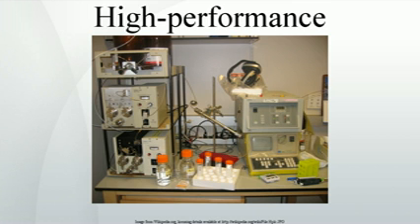This solvophobic effect is dominated by the force of water for cavity reduction around the analyte and the C18 chain versus the complex of both. The energy released in this process is proportional to the surface tension of the eluent, water, 7.3 x 10^-6 joules per centimeter squared, methanol, 2.2 x 10^-6 joules per centimeter squared, and to the hydrophobic surface of the analyte and the ligand respectively.